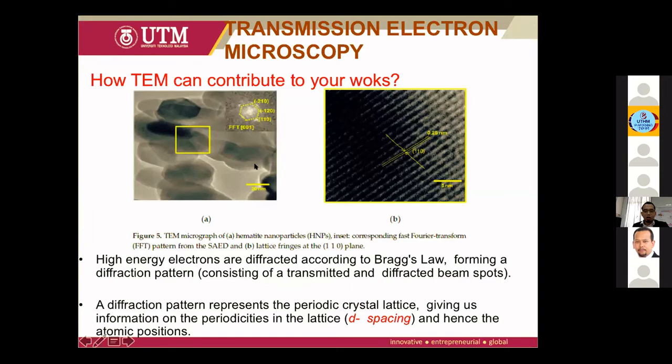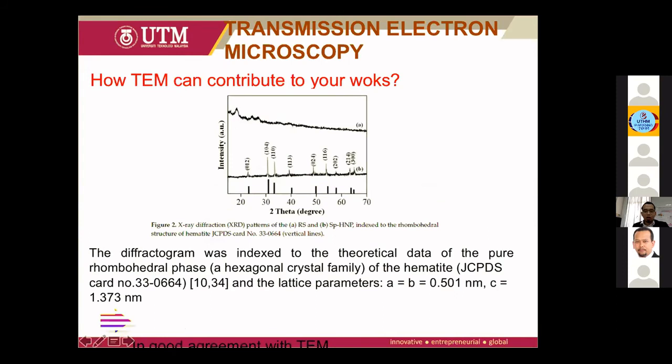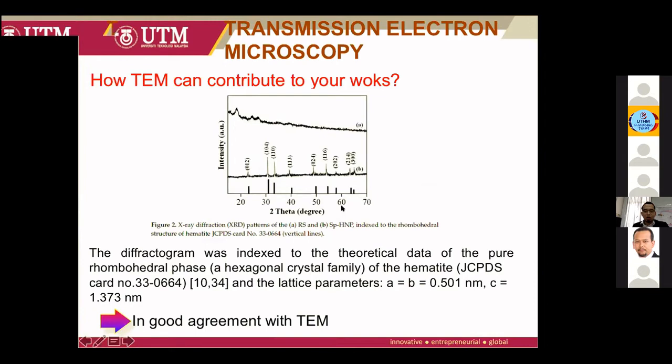Okay, so what I would like to emphasize here is that the TEM image is not only important to give you the size and structure. You can further analyze it to support and be in good agreement with your XRD, as done here. And we can actually calculate the lattice parameters also.